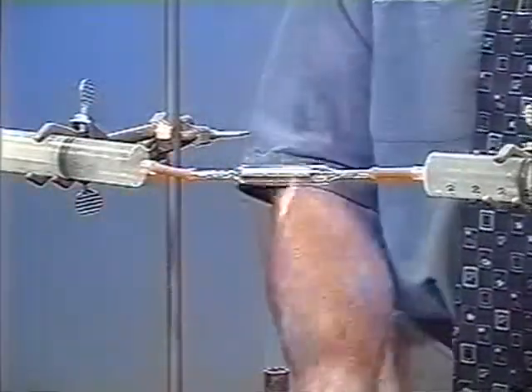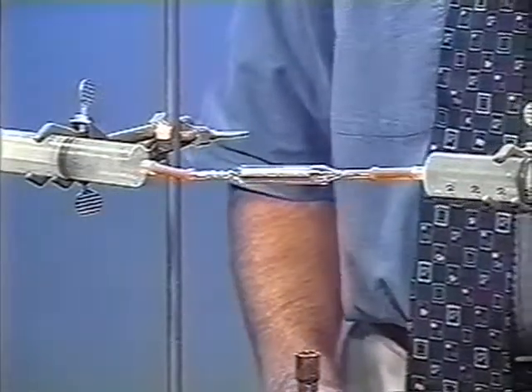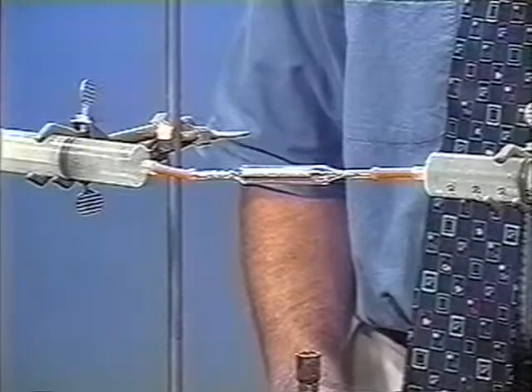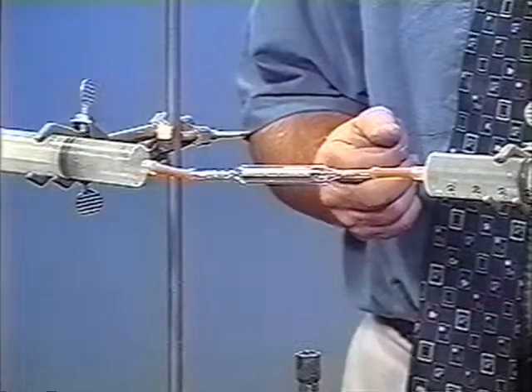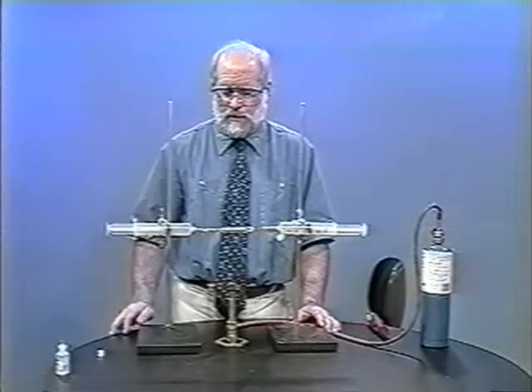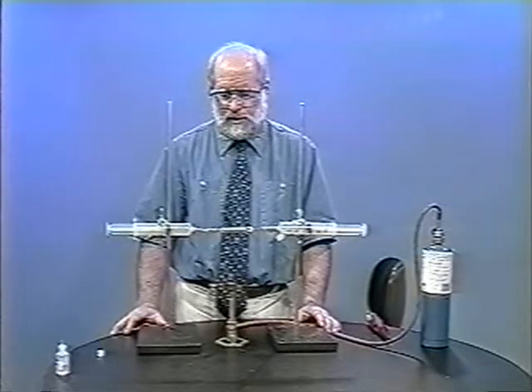It's a very nice device and it can be used to catalytically oxidize all sorts of hydrocarbons, always reacting them with air. It can also be used to catalytically hydrogenate ethene, turning it into ethane. The next thing I would do in a laboratory setting with students is to take the gas that's collected and bubble it through lime water to confirm that carbon dioxide was made, or inject it through a gas chromatograph and notice carbon dioxide.